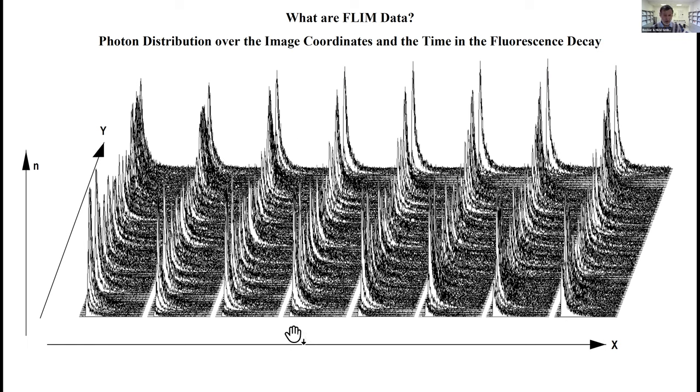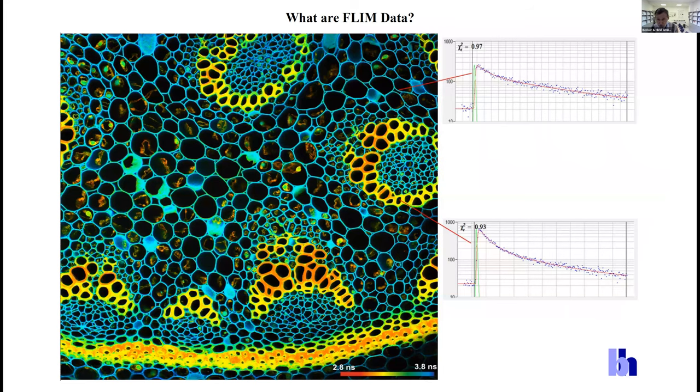All the peaks you see here are actually fluorescence decay functions in the individual pixels. The task of the FLIM software is to convert this ugly photon distribution into a beautiful image. We have it here. The FLIM image represents the image of the sample in a false color representation where the color represents the fluorescence lifetime.